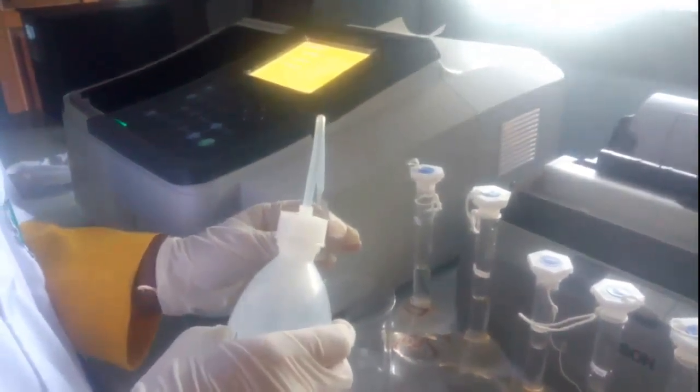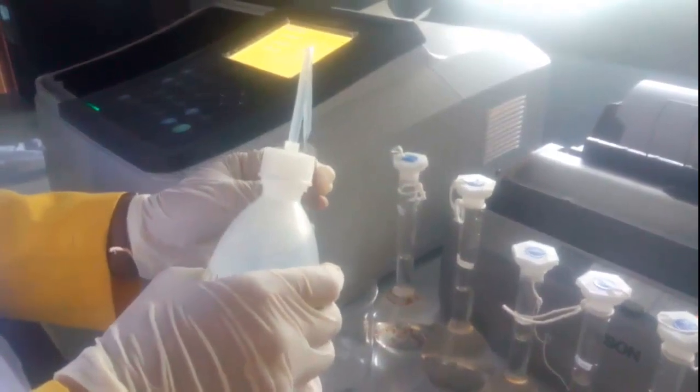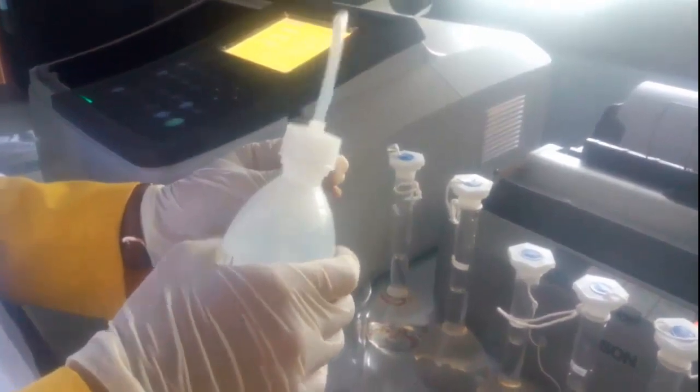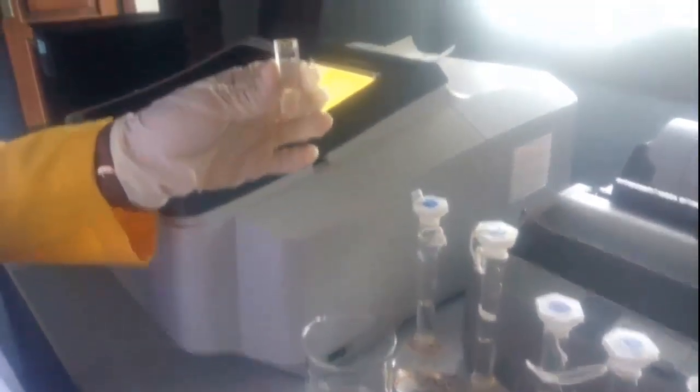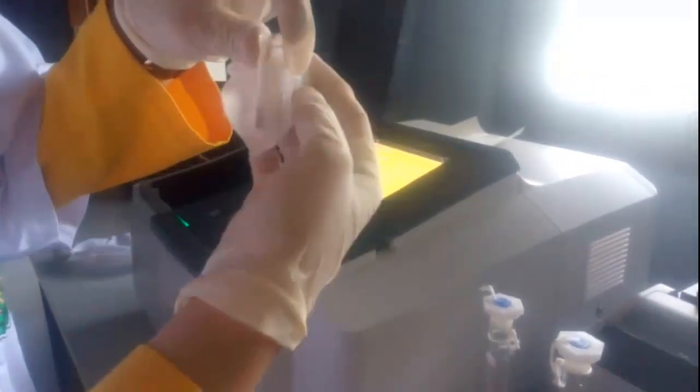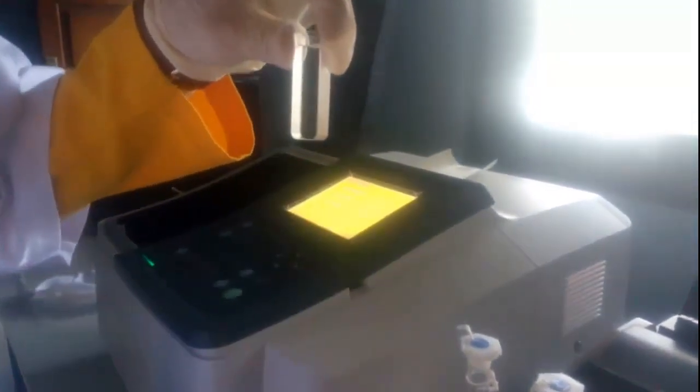Wash off the second cuvette with aquadest. Pour the aquadest as a blank into the cuvette. Wipe the cuvette with tissue. With the opaque side facing you, put the cuvette in the reference slot.